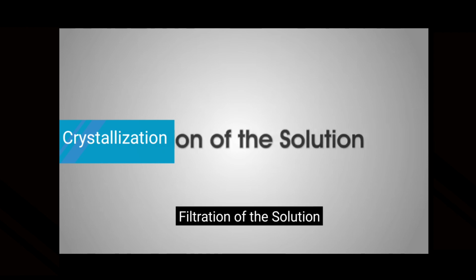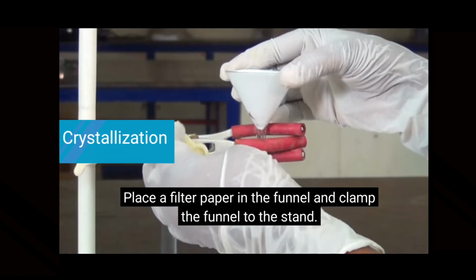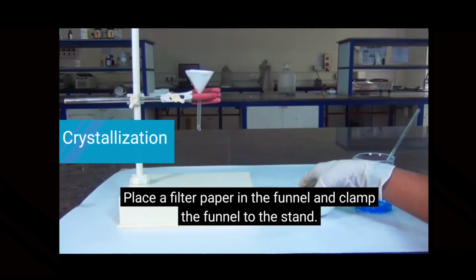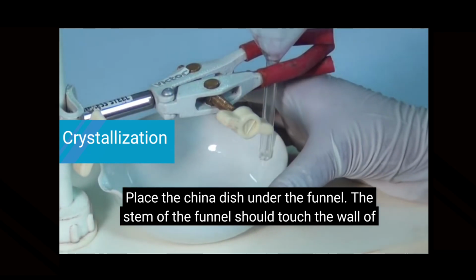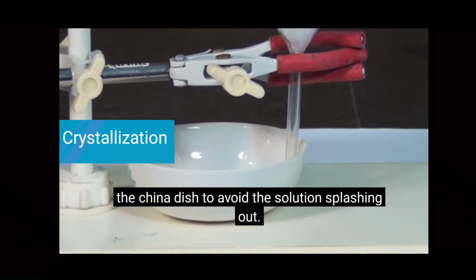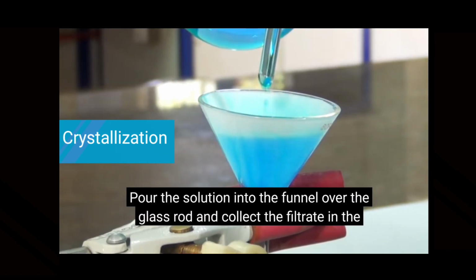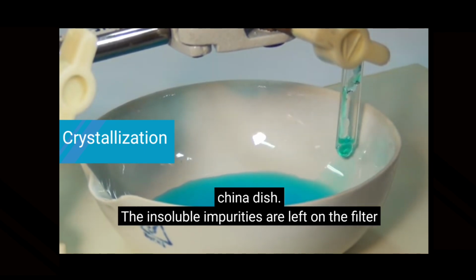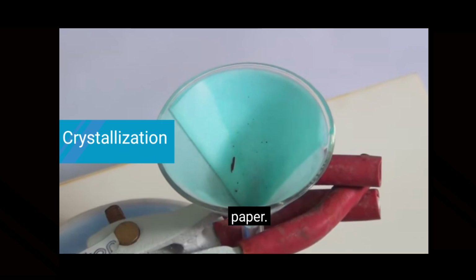Filtration of the solution. Place a filter paper in the funnel and clamp the funnel to the stand. Place a china dish under the funnel. The stem of the funnel should touch the wall of the china dish to avoid the solution splashing out. Pour the solution into the funnel over the glass rod and collect the filtrate in the china dish. The insoluble impurities are left on the filter paper.